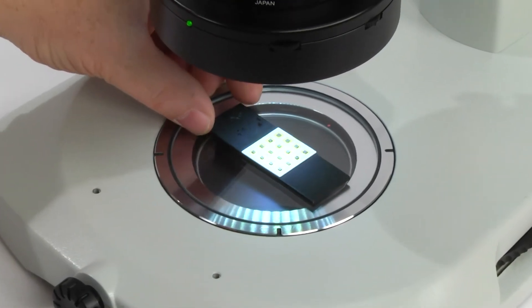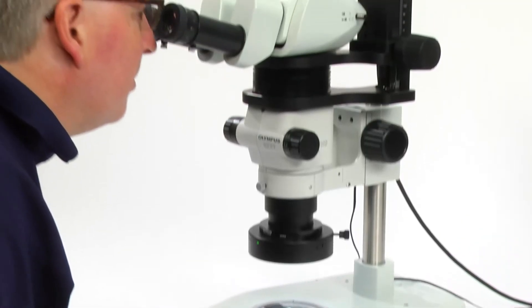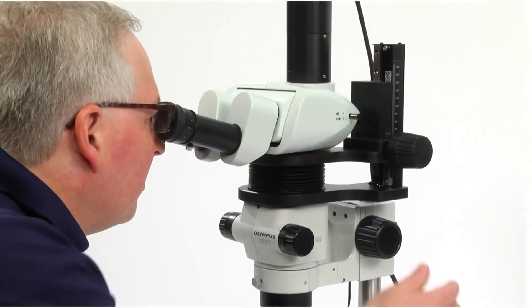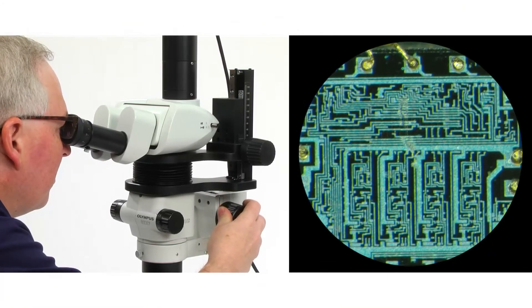First, place a sample on the stage plate. While looking through the eyepieces, bring the image into focus using the microscope focus knob.